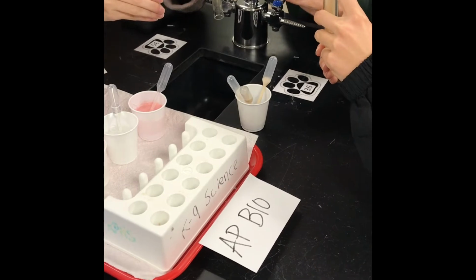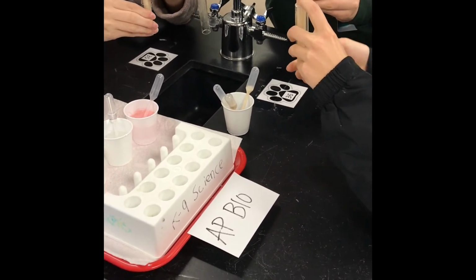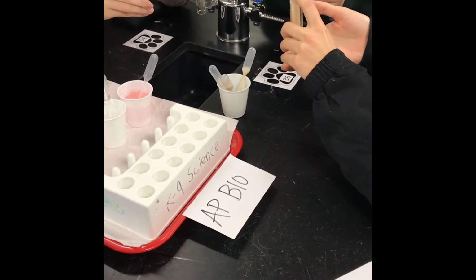Okay, so they capped them, and there's no rush now. They just cut off oxygen, and when they're ready, they're all going to invert them and turn them upside down so that they can ferment in the tube. Okay, you ready? 1, 2, 3, go.